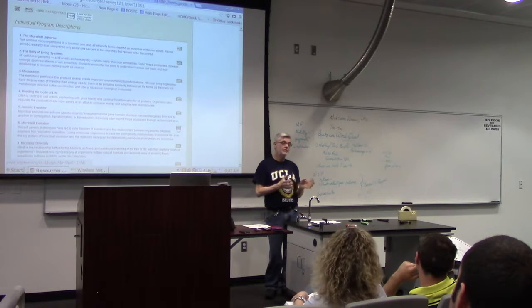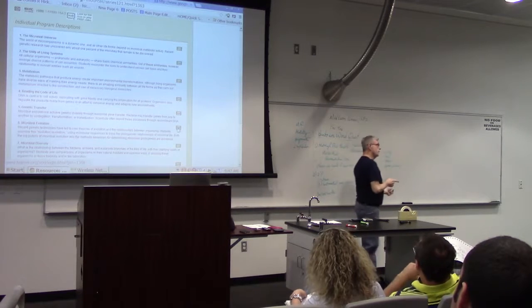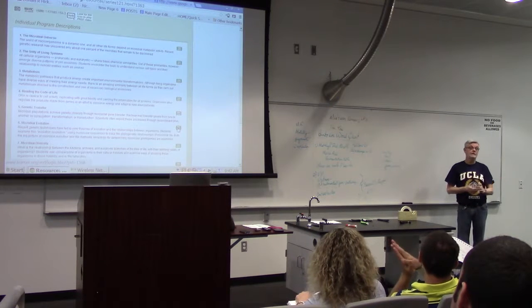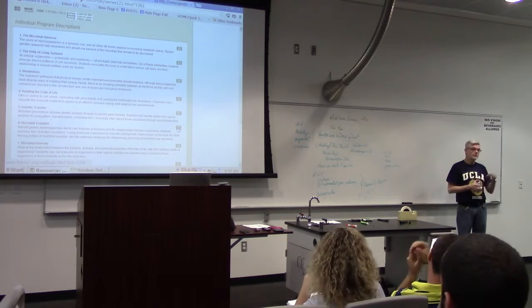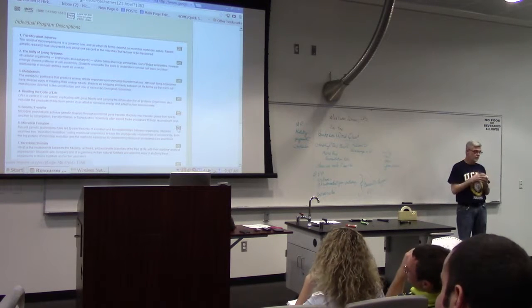And sometimes they revert in the middle of the 7 days. So if you did it on Monday and came in on Saturday to read it for the very first time, it might have gone to yellow and back to pink. Somebody in here did. Who was it? Yeah, hers reverted. So if you don't read it every other day, it can give you an important misleader in your results.